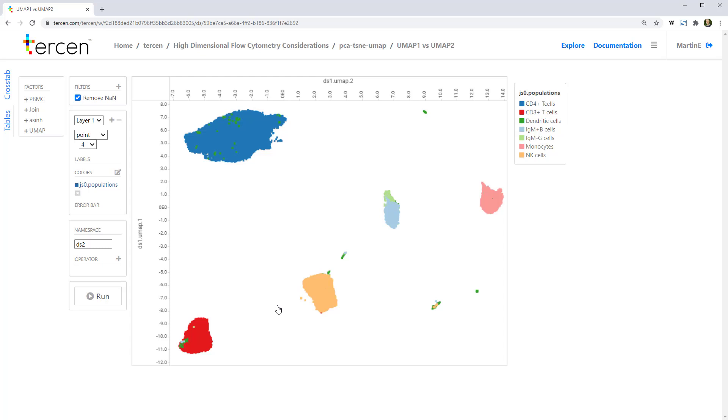UMAP, we see, is giving better separation of the populations, and is doing better at preserving their global structure in relation to each other.